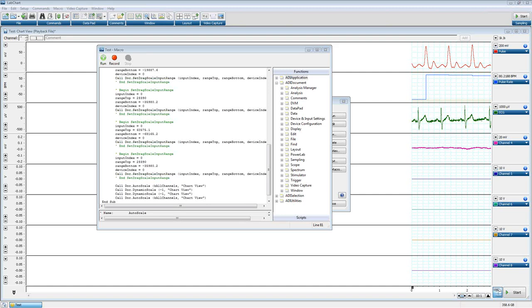Next question here is, I would like to create a macro that takes data from Excel or Access of environmental oxygen levels during a period of time, and then use these values to set points that PowerLab would use to control external devices that maintain oxygen levels within these set points. I do believe that's something that's possible. Now, I'm not entirely sure how to do that. I have done things with PowerPoint before. We've done things with Excel before.